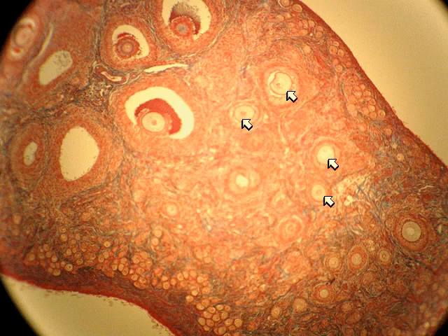In some of these, you actually can see the cell inside, like this one I've put in 2 or 3 arrows on. And another one, you may not see the cell inside simply because of how it's been sectioned. And then you can see some pretty mature follicles here and here. And I want you to notice this cell. That's for lab, you can again call that the ovum. Technically, that's the secondary oocyte.